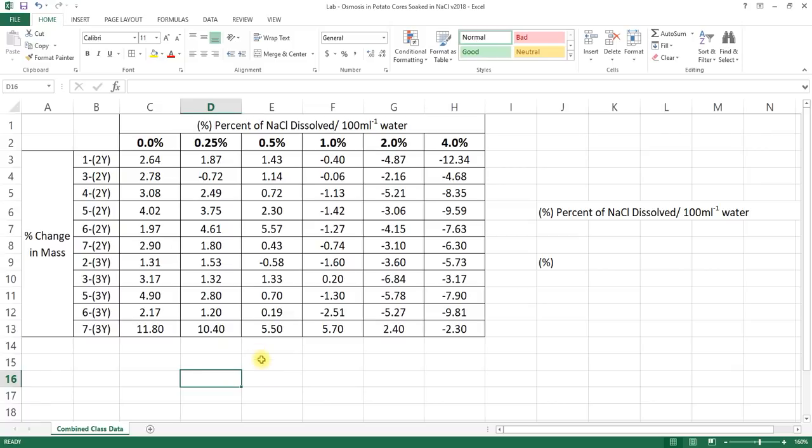But what else do we need here? And the answer is we need to have a mean. Make sure you write mean. And do you notice some of the data here is all over the place? Like this group got 11.8, but yet everyone else was around the 2, 3, 4 range. This shows there's quite a diversity in our data. We need a second category called standard deviation. You may just put SD for that. Standard deviation is basically the range, but we're only looking at the middle data that's right next to the mean.